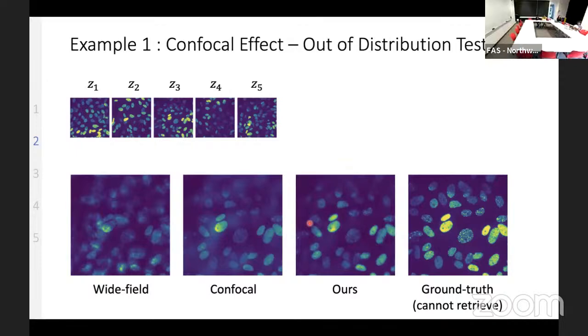The second question is, when you put in a pinhole, it follows a rule, right? If you put in a pinhole, it rejects a lot of the out of focus light, and most of the in focus light passes through because of the geometry. You can even do it in geometrical optics and see how the light passes through.